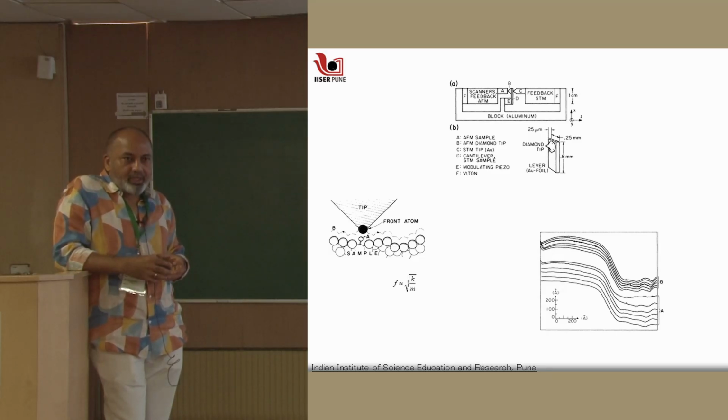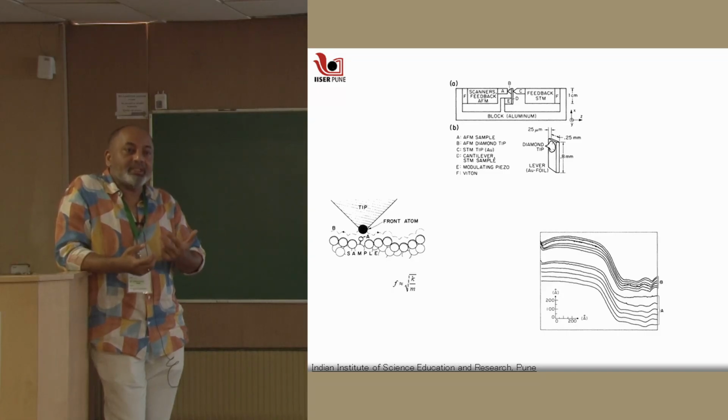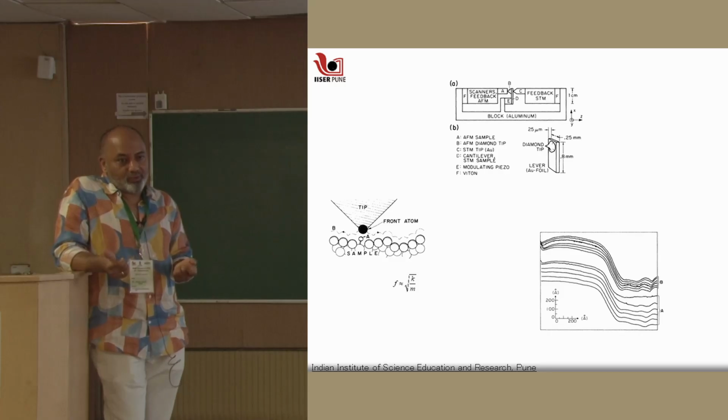They do get pulled, and later people realized that the amount by which they get pulled up is extremely small. Okay, so essentially two atoms will have a Lennard-Jones potential, right? But that's only when there are two atoms. If they're sitting on a background of a tip and the substrate, they don't remain Lennard-Jones anymore. So they are more tightly bound to the whole thing.